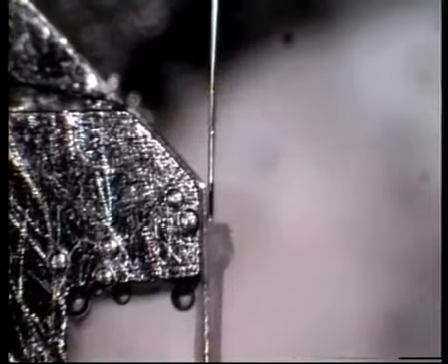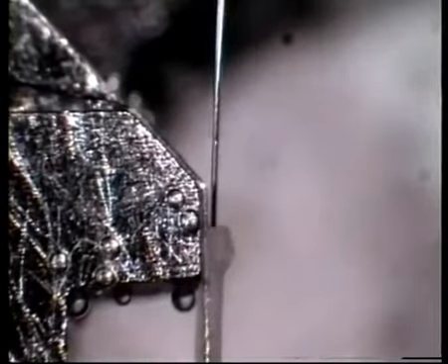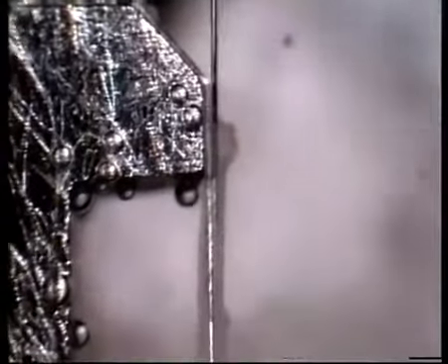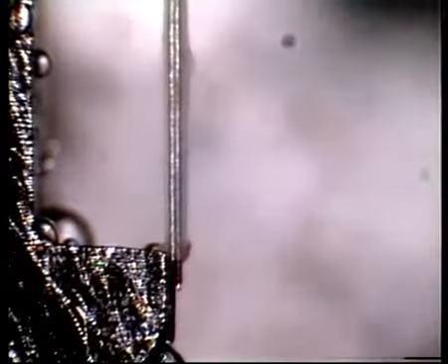Now the second wire should be introduced into the lumen. You can use the first wire as a guide. The best mounting will be if you, in one movement, can get the wire through the whole length of the vessel, of course in a very slow and controlled manner. When the wire has gone through the whole length of the vessel, you can let go of it and pull it the rest of the way.